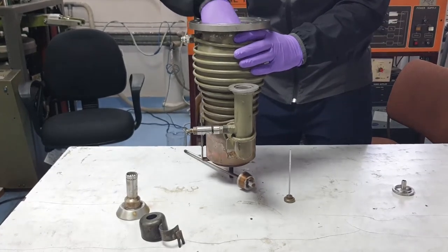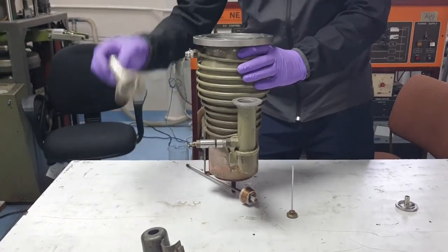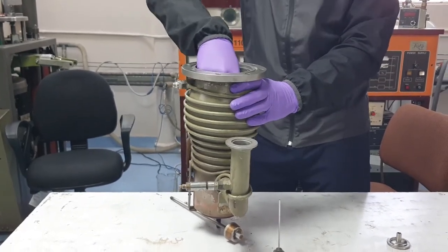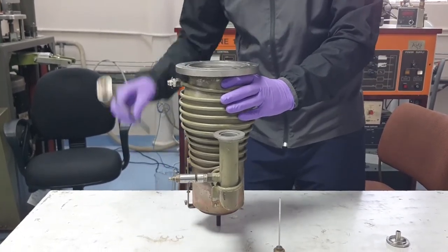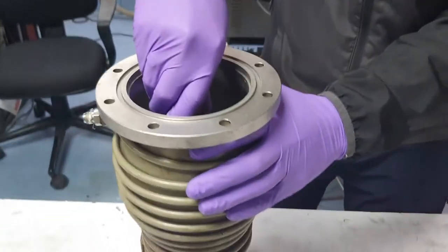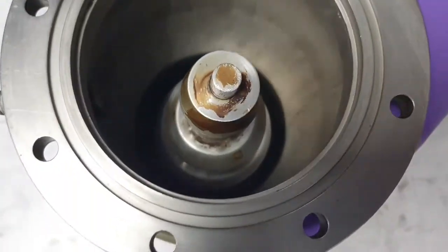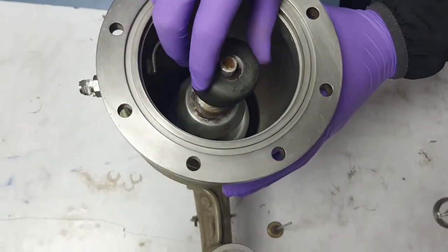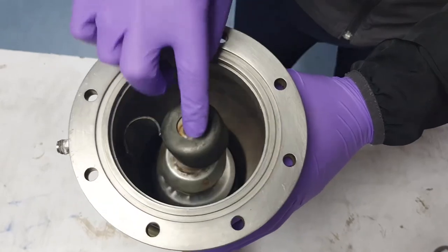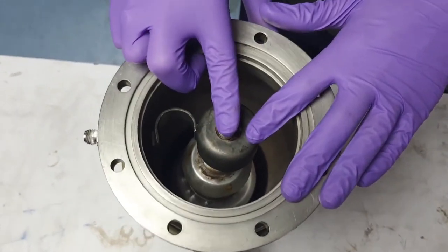This is the second stage, this is the last one, and now this is the top part. This is the jet assembly of the diffusion pump — this is the first one.